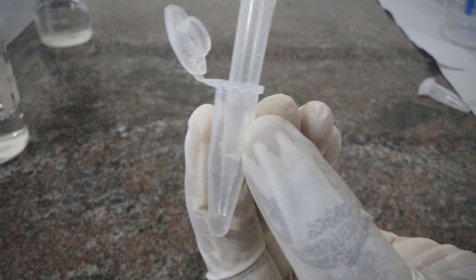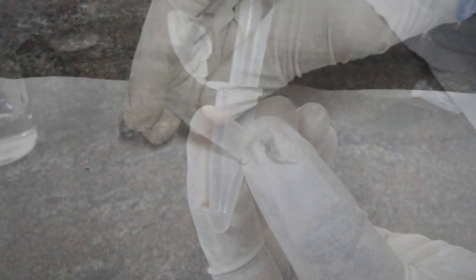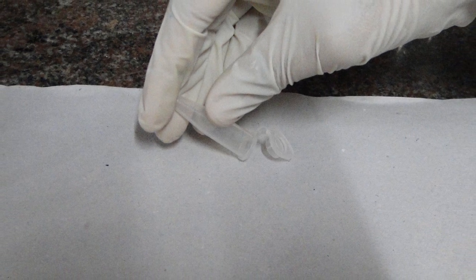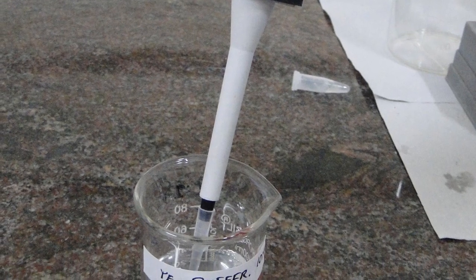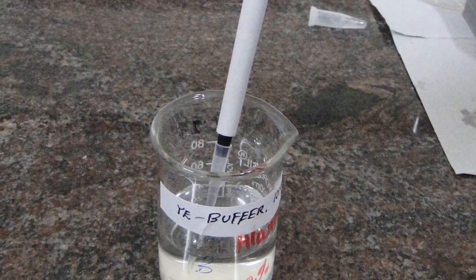Decant the ethanol or supernatant using the pipette. Keep the vial at room temperature for the ethanol to evaporate. Then dry the vial on the blotting paper. Once the vial is dried, add 50 to 100 microliters of TE buffer.